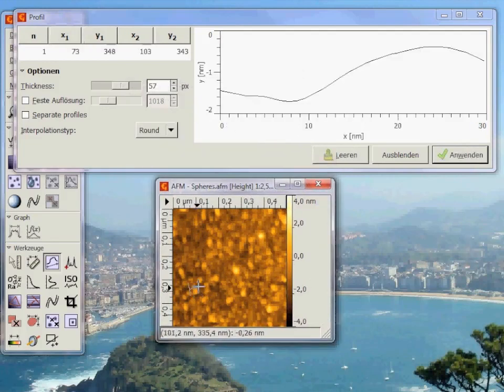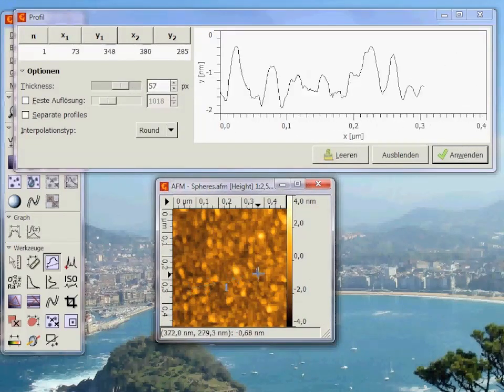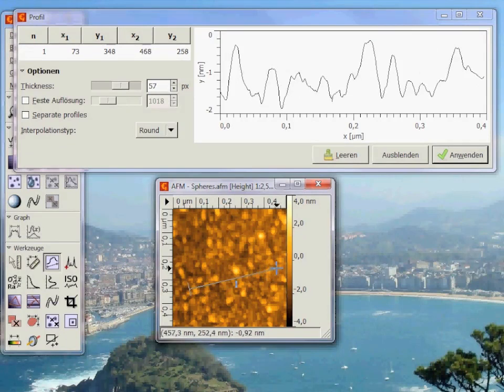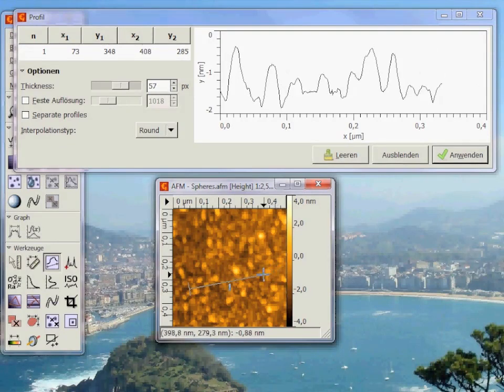Define the line position, length and the thickness of the line. This feature is very nice since you can average over many parallel lines like this.